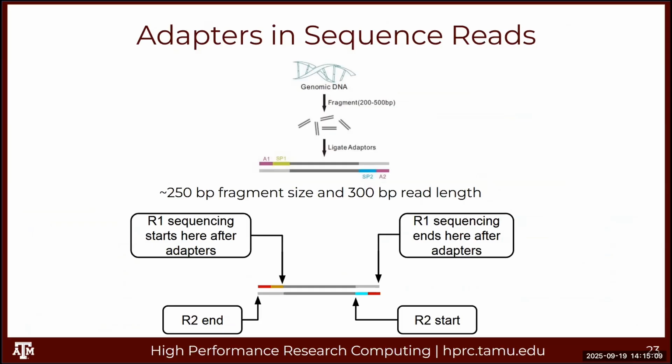the sequencing process, they're on the ends of the strands. And then let's just say the sequencing is longer than the fragment. So the sequencing on the top strand starts here, it goes across, and it reads all the way to the end. It doesn't know when to stop. It just reads to the adapter on the end here. So we need to trim that off because it's not part of the DNA. It's not part of the genome. So we'll do some trimming in a little bit.